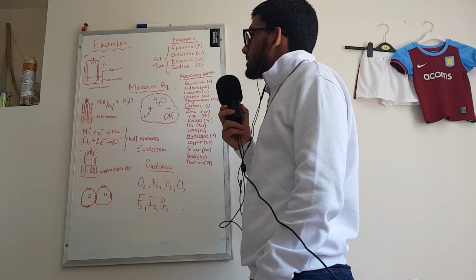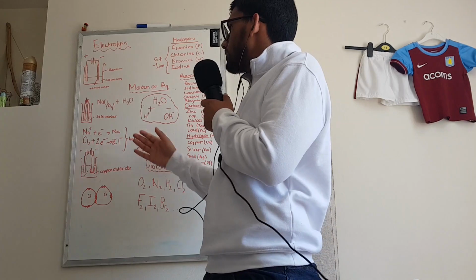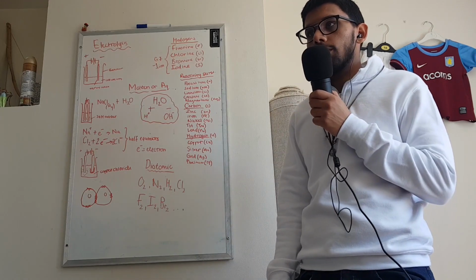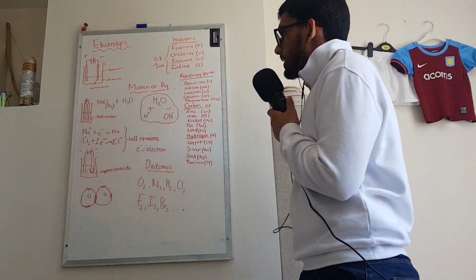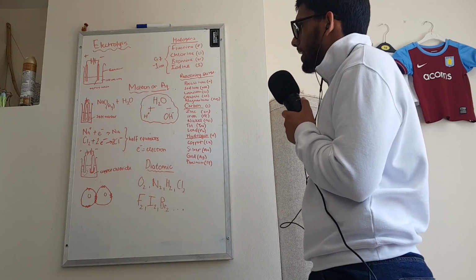How does electrolysis happen? Well, it's fairly simple, as I said. You have the solution inside a beaker, and you have two terminals. The terminals are named anode and cathode. The best way to remember them is one stands for the positive and one stands for the negative, and use the acronym PANIC. Positive is anode and negative is cathode. It's fairly simple to remember. Just remember PANIC when you're panicking.